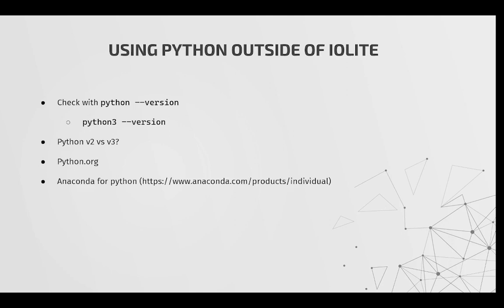Another option is to use Anaconda. Anaconda is specifically set up for data science. It also comes with a few tools that you might find useful for writing code, and when you get a little bit further along and more advanced, there'll be some extra tools in there that you'll find handy.